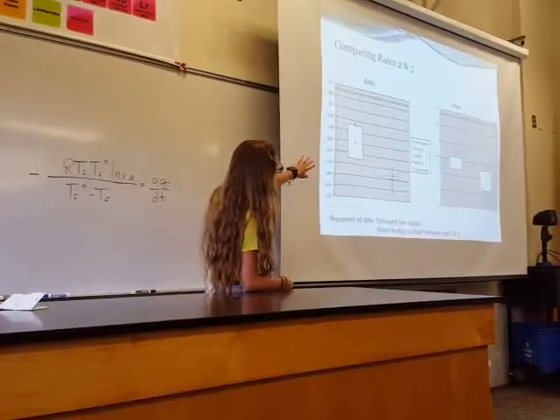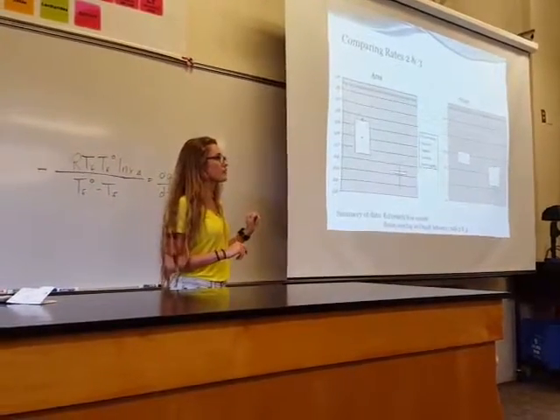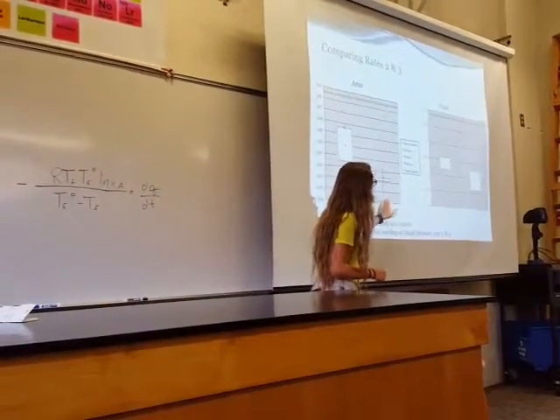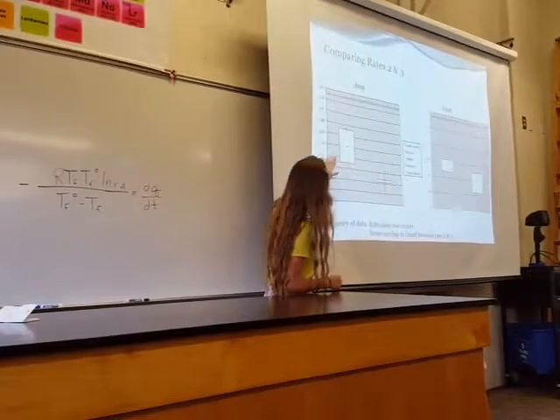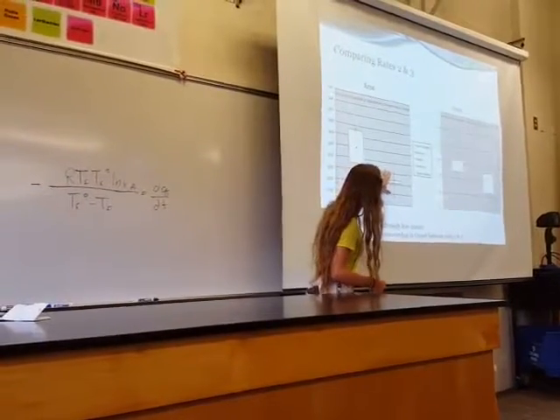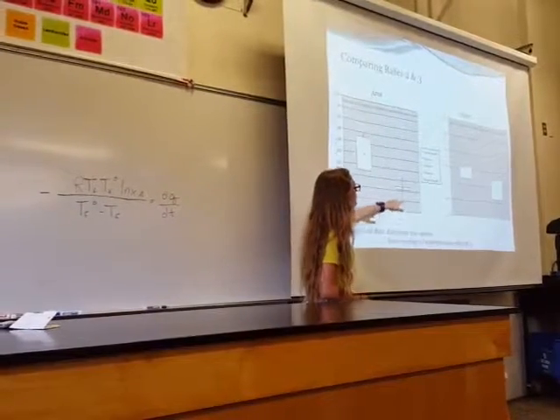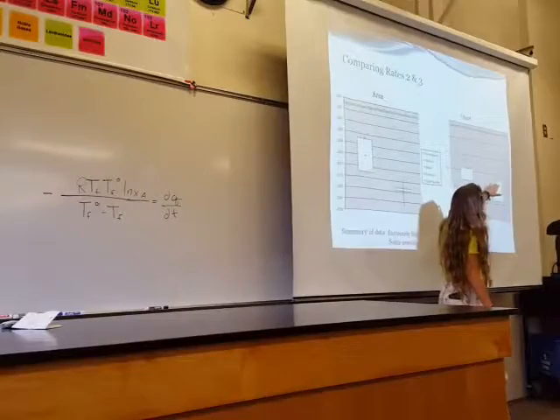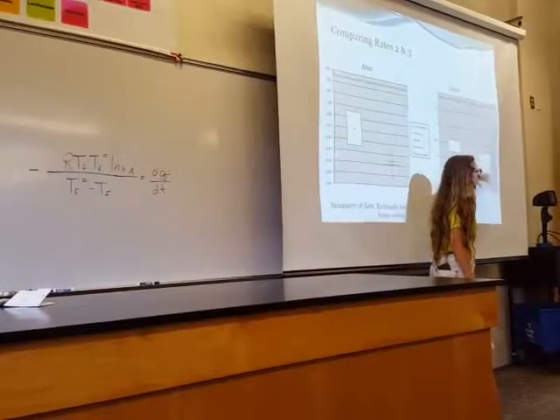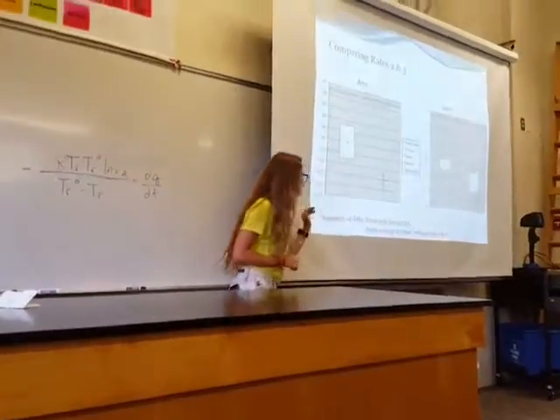So here, these are box plots, Box-Whisker plots for the freezing curves. And this is comparing rate 2 on the right side and rate 3 on the left side. And so this is showing the area under the curve and the difference between them. So this shows a very clear difference, very significant for the difference in area between rates 2 and 3. And then here, this shows that at least for rate 3, the onset could be expected to be much more negative. However, these values were a little bit more scattered or had a larger standard deviation.